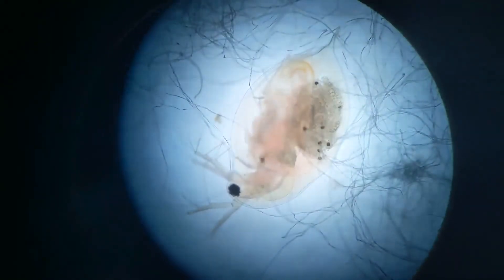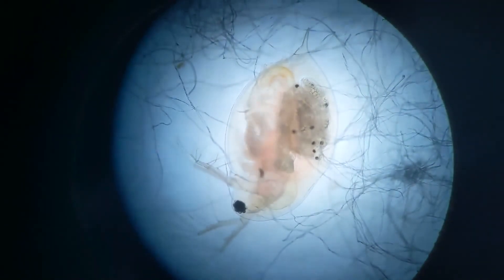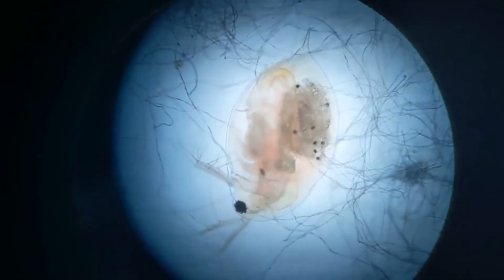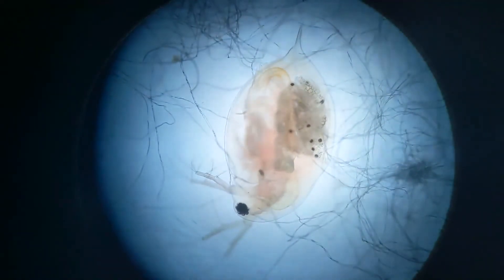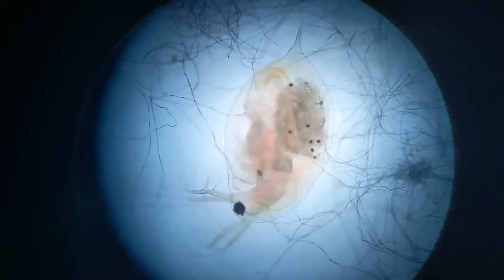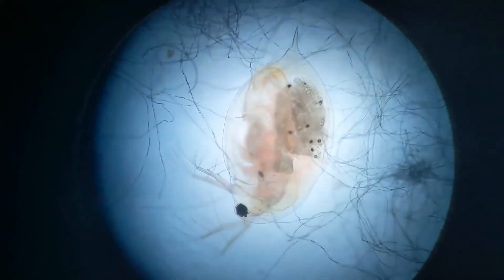Now try and work out the heart rate again for another 10 seconds. I can then recount the dots: 1, 2, 3, 4, 5, 6, 7, 8, 9, 10, 11, 12, 13, 14, 15, 16, 17, 18, 19, 20, 21, 22, 23, 24, 25, 26, 27, 28, 29, 30, 31, 32, 33, 34, 35, 36, 37, 38, 39, 40, 41, 42. We've got 42 this time.